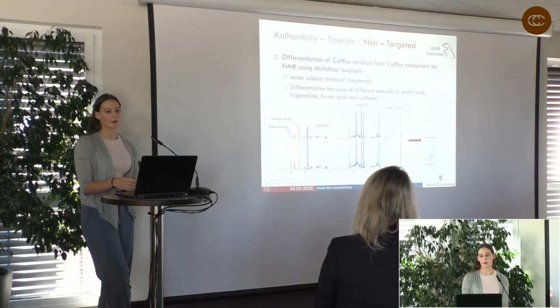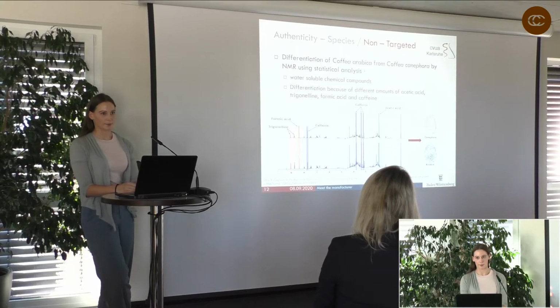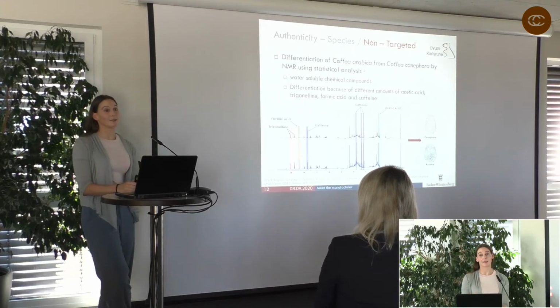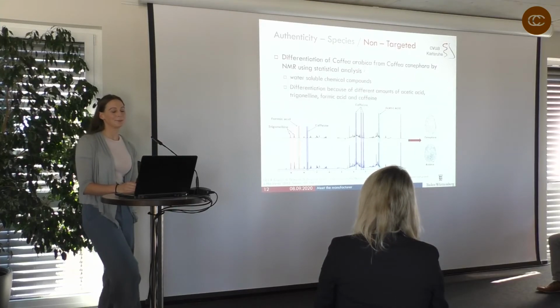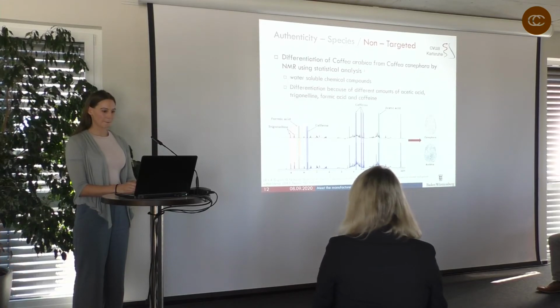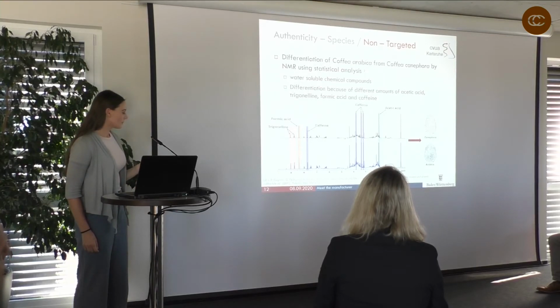And what could be here? Really some nano shifts? Or what could be here in that example between these two spectra? Where could be the difference? For example, the Canephora coffee has a bigger amount of caffeine, less amount of formic acid and acetic acid, for example. But often we can't see it with our... Yeah, really.